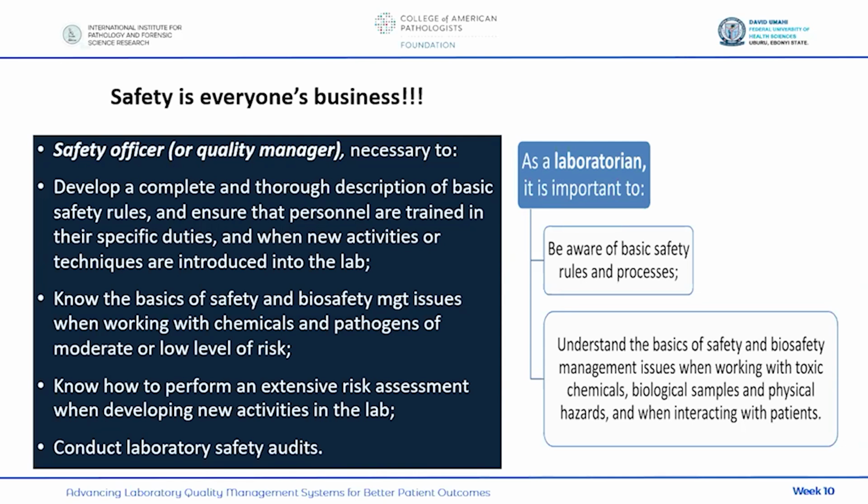in the activities which currently occur in the laboratories, and also when you introduce new tests, new activities into the laboratory, you need to explore around the safety concerns of that new activity which you are introducing. And after exploration, you are expected to train the staff about those new activities for them to be aware of safety concerns about the new activities which you are introducing into the laboratory. It's also necessary to know the basics of safety and biosafety management issues when working with chemicals and pathogens of moderate and low level of risk. It is also necessary to know how to perform an extensive risk assessment when developing new activities in the lab. I just mentioned that.